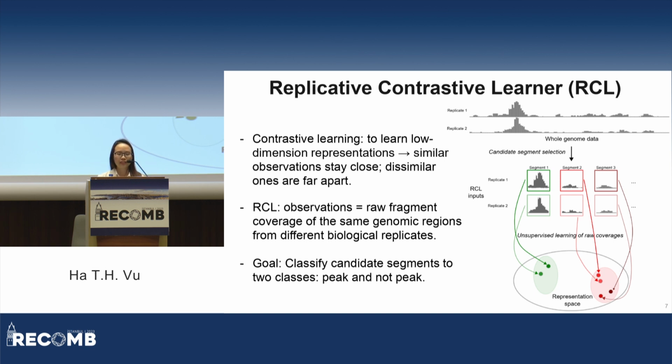And the framework contains two main steps: candidate segment selection and classifying the examples. Whether the peaks cluster together would depend on several factors.